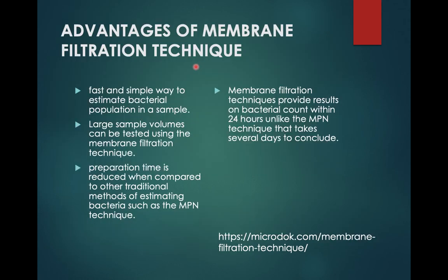Some advantages of the membrane filtration technique, aside from the things I've mentioned already: it is fast, and you can process very large sample volumes, because you can use only one filter for a very large volume of water sample. The preparation time for the membrane filtration technique is also shorter compared to the multiple tube fermentation technique.